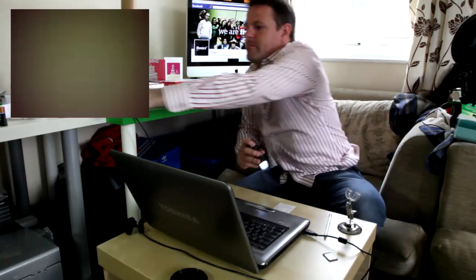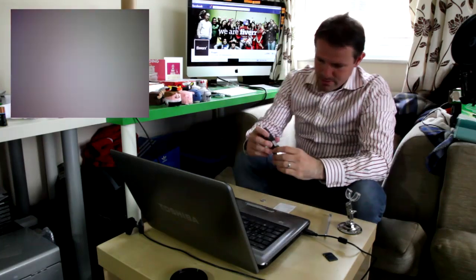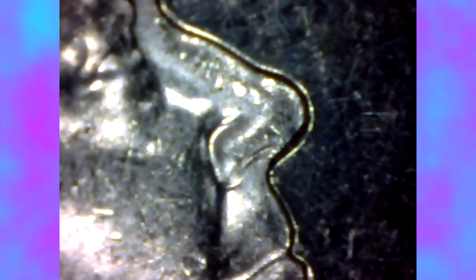Now a 5p coin — these tiny things. It's got the queen on it. I think I can focus on the queen mother's nose. Look at the right way around — so that's her nose. Let's get the focus right. Isn't that cool? I thought it's pretty cool.